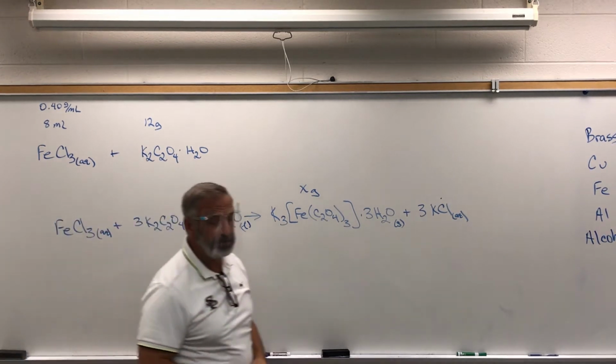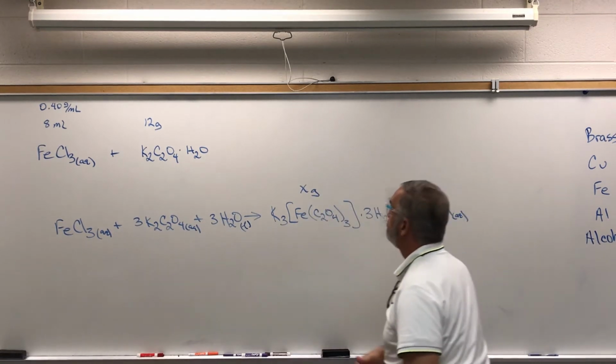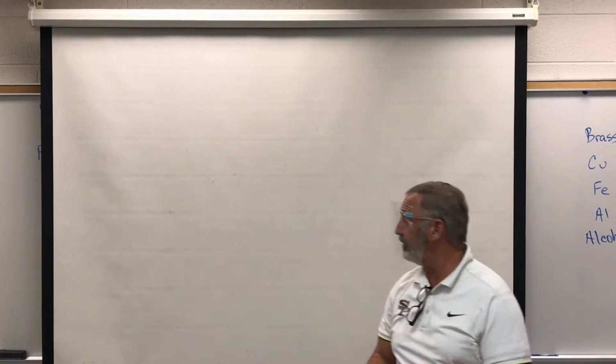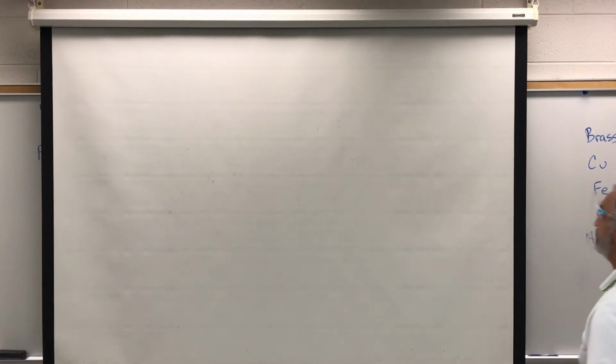Now, we're also then going to measure 8 milliliters in a graduated cylinder. And I shouldn't have to go over this, but I'm going to. Slowly, slowly, slowly.